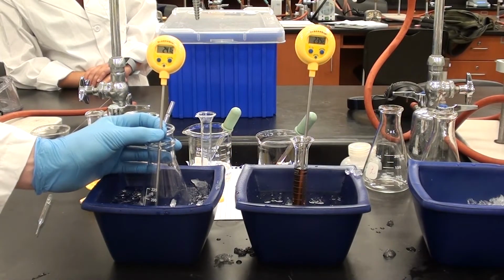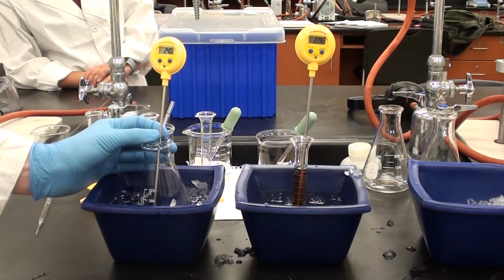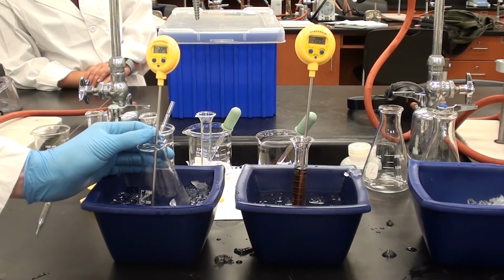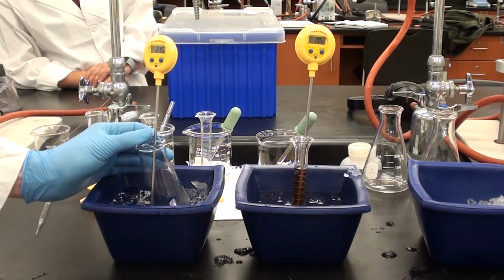Now as we see this, I'm watching the temperature go down. The temperature is going down on the iodine pretty quickly, and not so quick on the other one. This is why it's important that we try and get them to about the same temperature. But if the temperature gets too low, we can simply remove them from the ice water, and that will enable us to warm up the solution. The other thing we can do is put our hand around it, and that will allow it to warm up as well if it gets down too low in temperature.